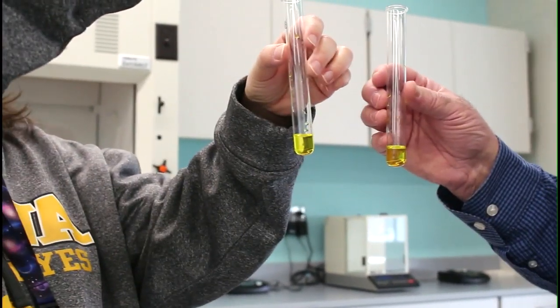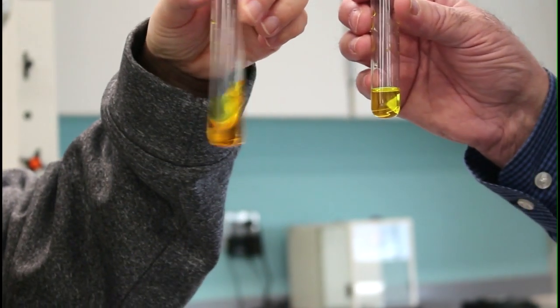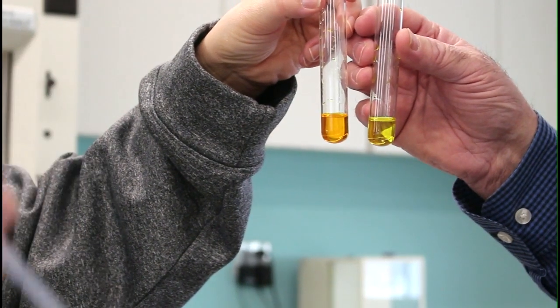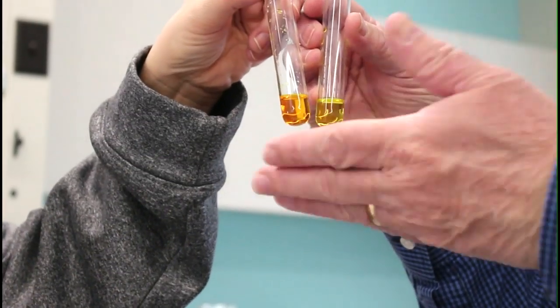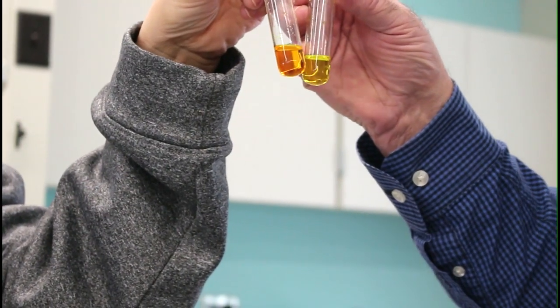But right now, the chromate is the dominant species. You see that? The equilibrium position is favoring the chromate. It says until something happened, and I see something happen, Dr. Snipes. Very good. Oh, wow, that was fast. So now the dichromate is the dominant species at equilibrium.